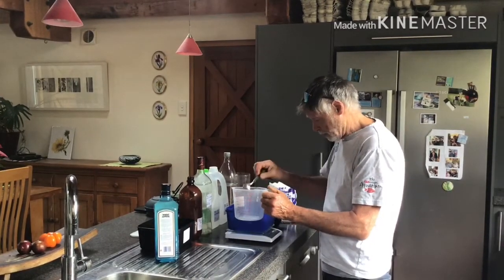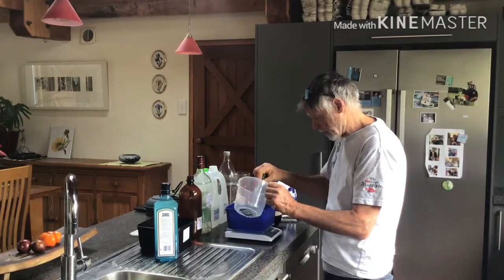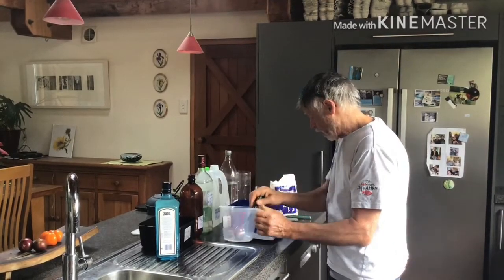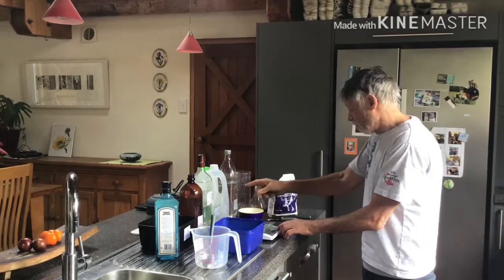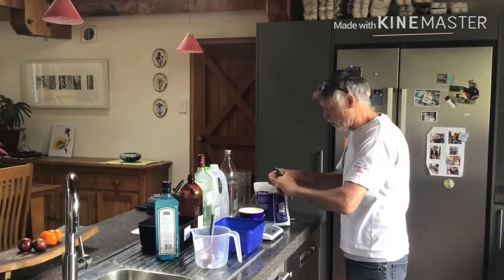Okay, we've got our 1,000 mils, exactly, our 1 litre, and we're going to measure into it, in this case, 5 grams of salt to make our 5 parts per thousand mix.